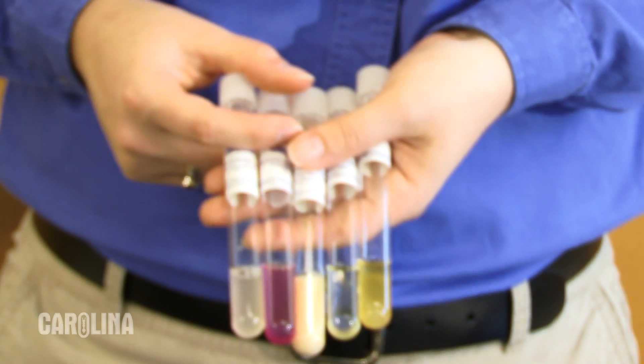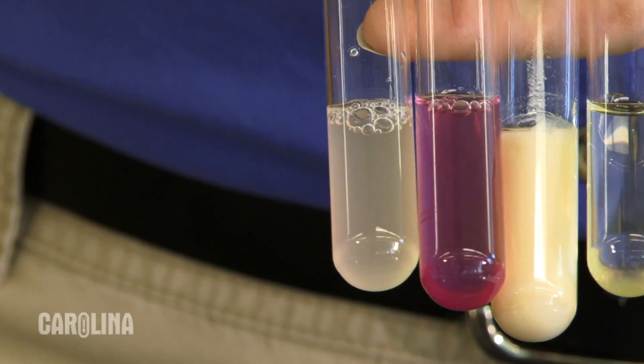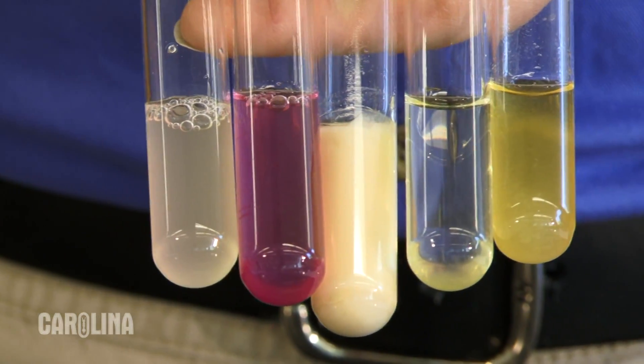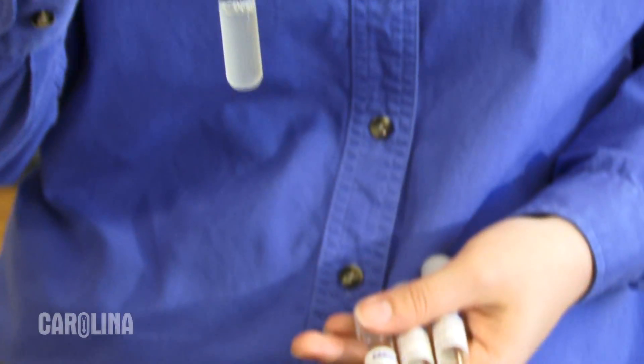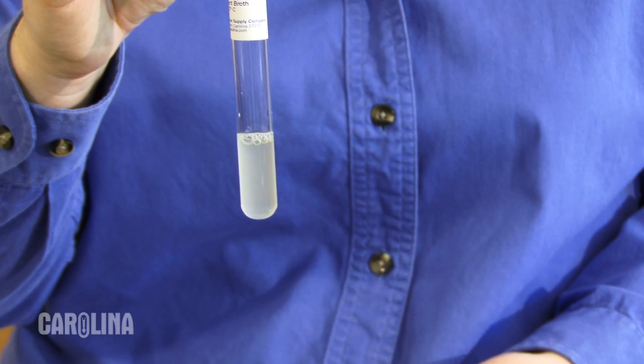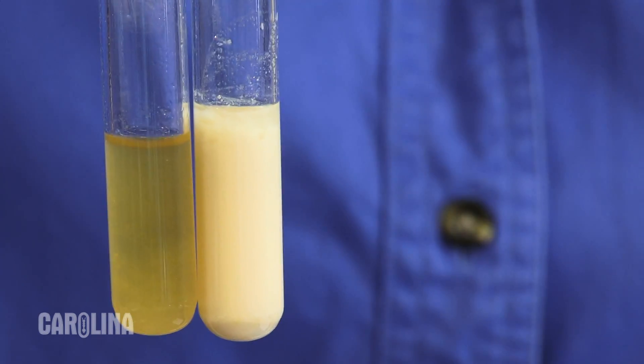These are broth cultures. Broth cultures are packaged in test tubes. They contain media for the bacteria to grow in rather than on the surface — there is no agar in the media to solidify it. The bacteria will make the broth look cloudy, sometimes colored, or the bacteria will appear as sediment in the bottom of the tube.